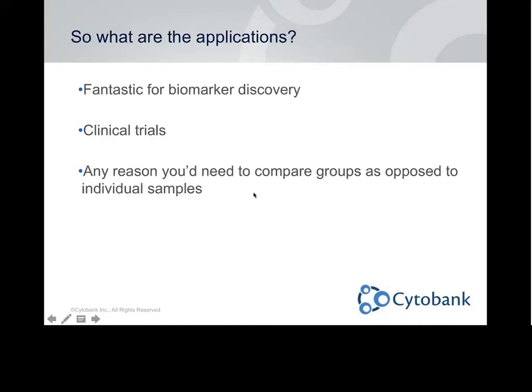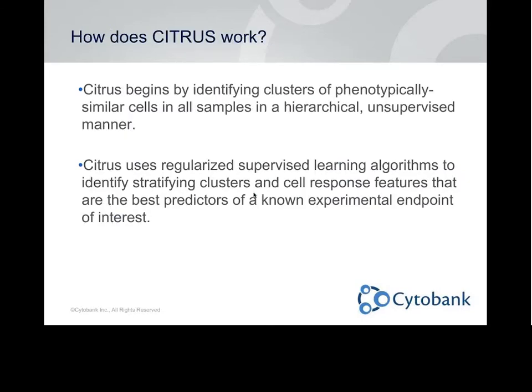So what are the applications? It's fantastic for biomarker discovery, for preclinical or clinical trials, for any reason you need to compare groups as opposed to individual samples. But what about the nitty-gritty? How does it go about doing this?